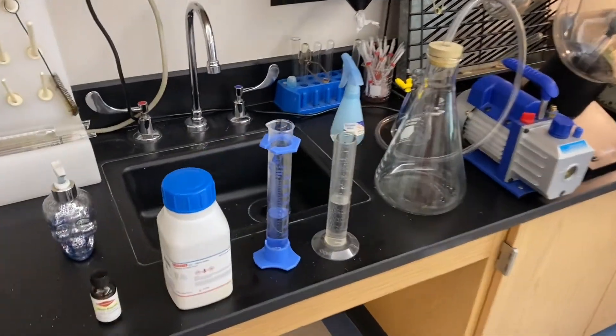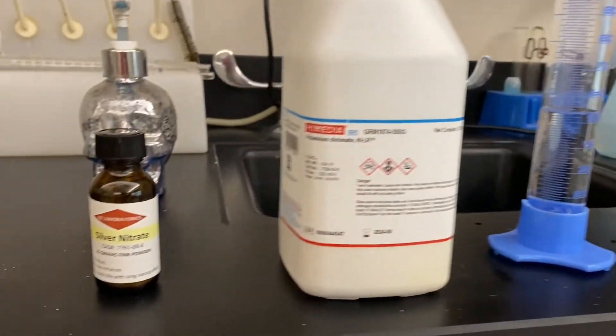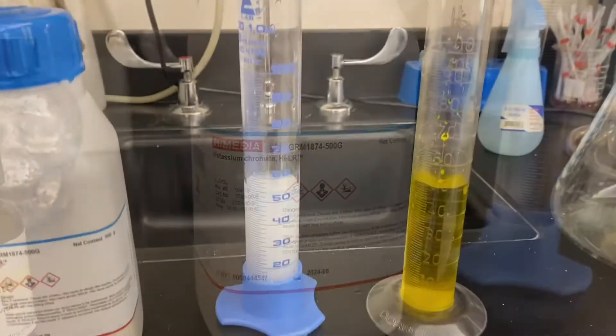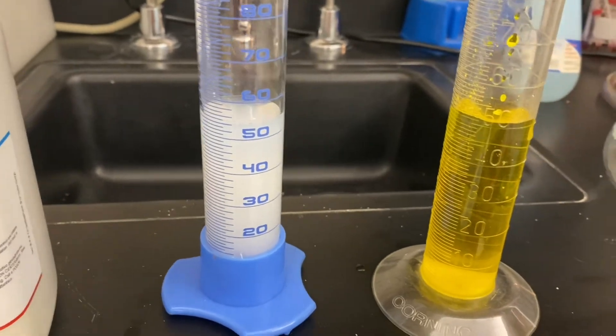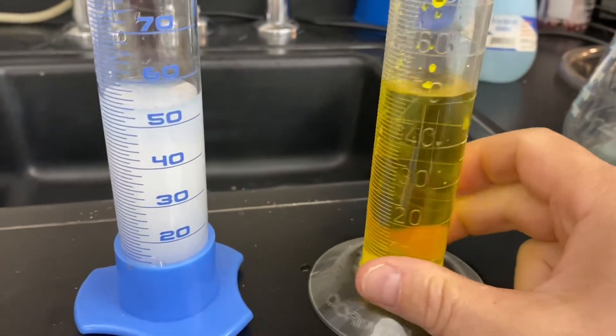All you need for this lab is a couple graduated cylinders, each with 50 milliliters of water, some silver nitrate, and a little bit of potassium chromate. The first step is to dilute 10 grams of silver nitrate into one graduated cylinder and 10 grams of potassium chromate into your second cylinder.